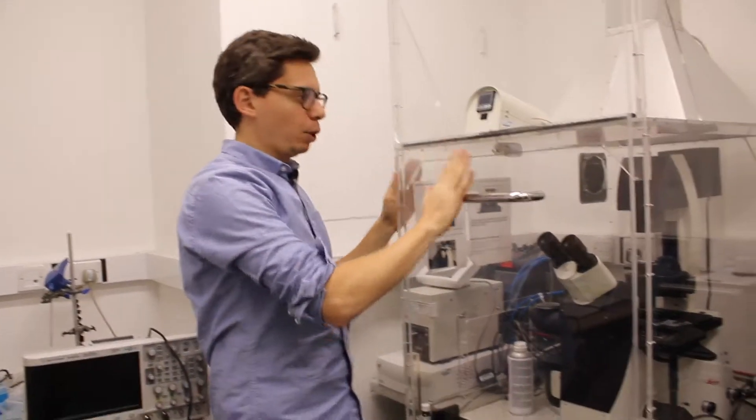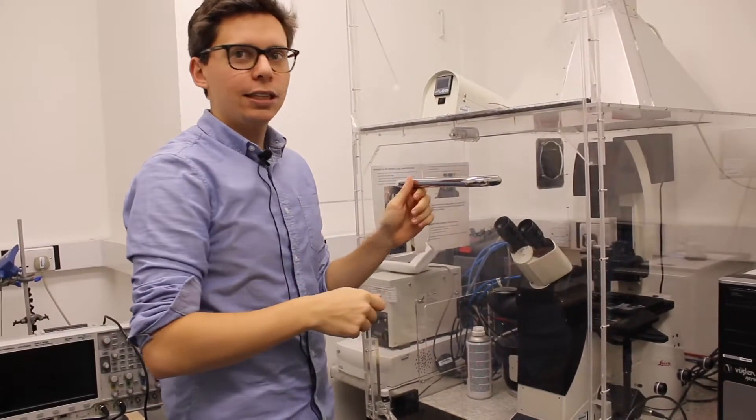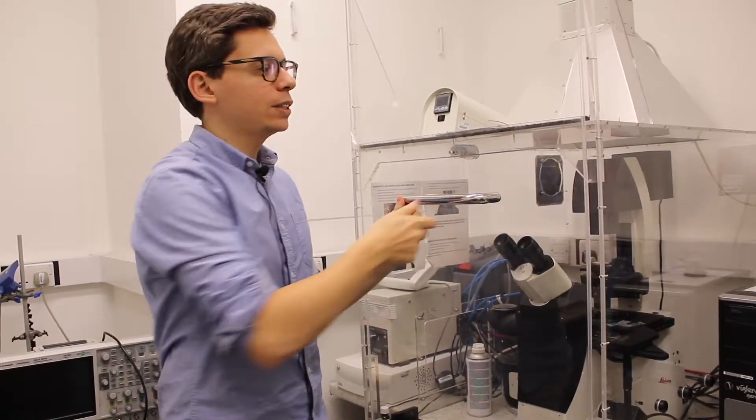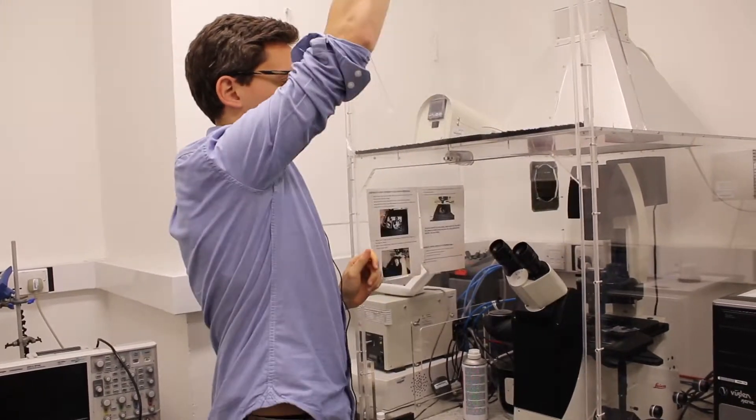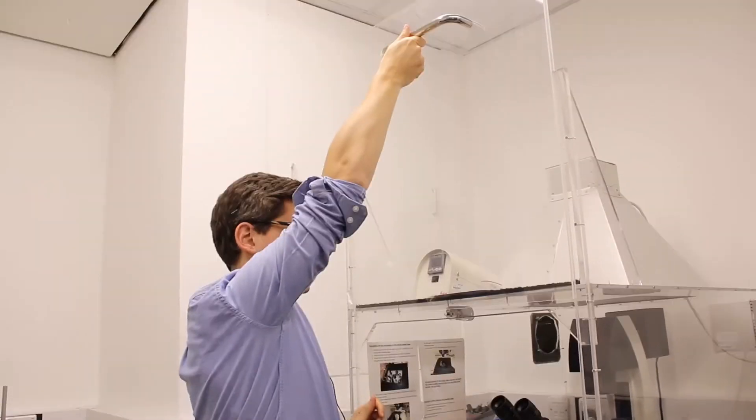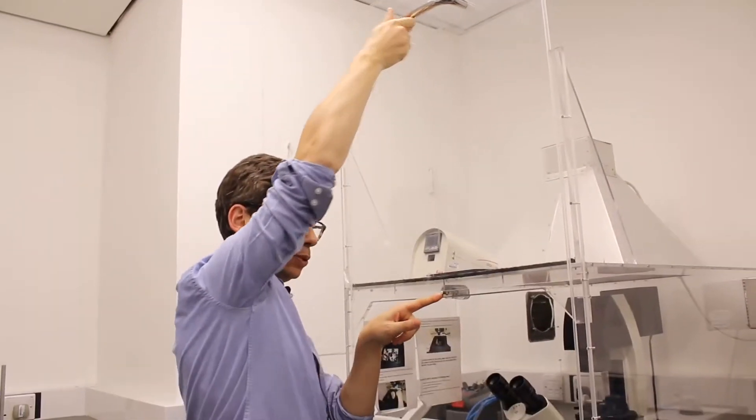The microscope is in this box to avoid having dust inside, so you should close it every time after use. You just open by pulling it out, and then there is a small thing here that will hold it.